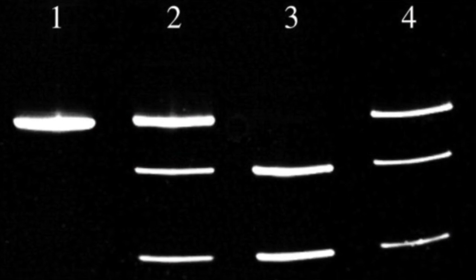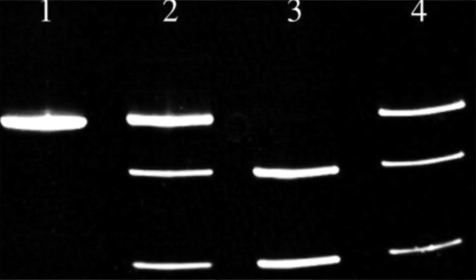And by matching up those bands to the different sizes and thinking about where our primers are designed, we'll know how big our products are and also basically what they are, which products were amplified in different situations. Basically, that's going to allow you to infer whether full or alternative splicing has happened in each of our different mini-gene cells. So we're going to discuss the interpretation in class, but before I do that, 3 safety points.